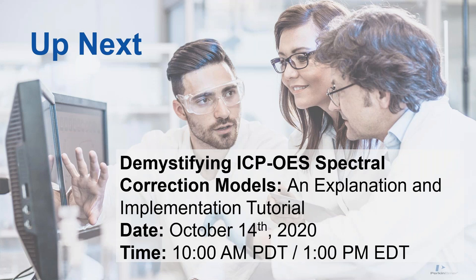That's why you're actually analyzing it, to try to figure out what's in there. So I always think it's good to go with the pure standard where you have a certificate of analysis. True, good point. At least you have a certificate of analysis to refer to if you see contamination. You can check the CFA, and if they also had contamination, you can rule that out as an interference potentially.